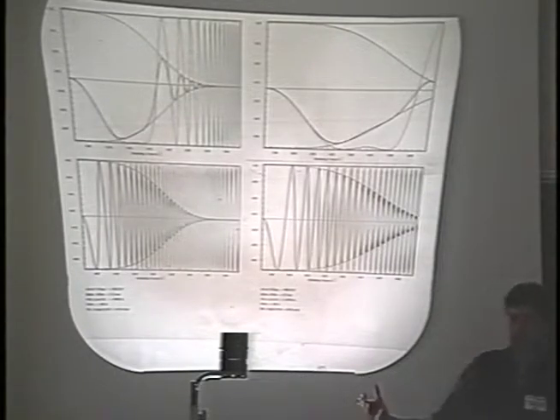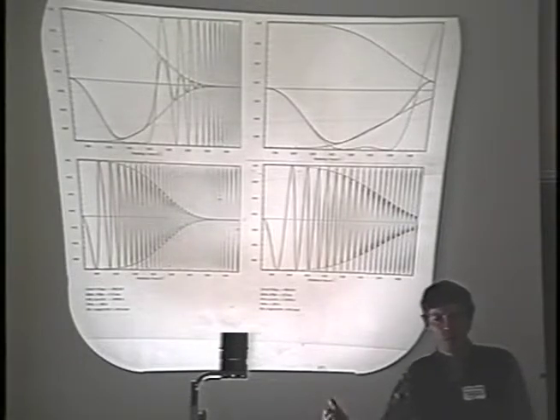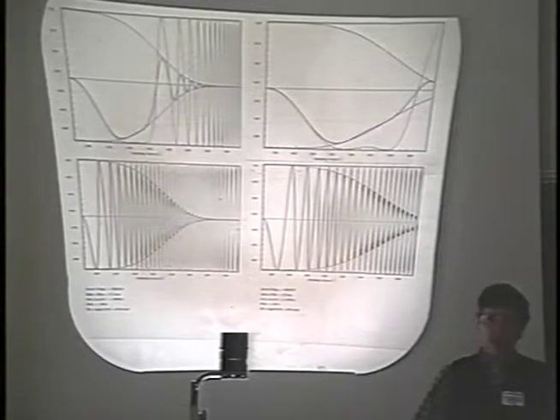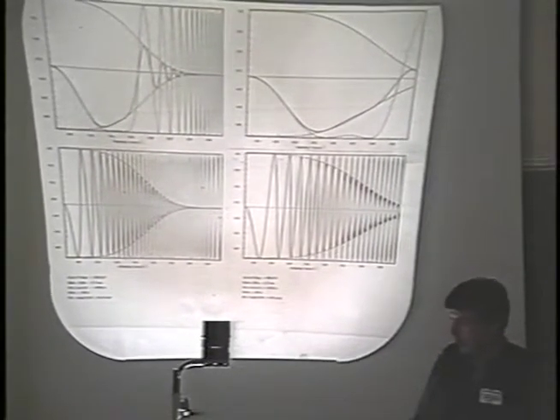There's a dewar full of liquid nitrogen that, if it's not performing right, will be bubbling away, or at least is somewhat subject to mechanical vibrations. And it's quite clear that in the case of our cold stages, the specimen is indeed bouncing up and down in some acoustically excited manner.